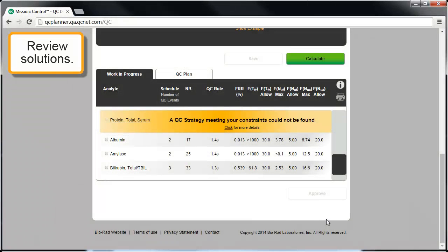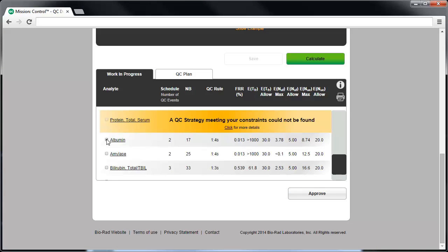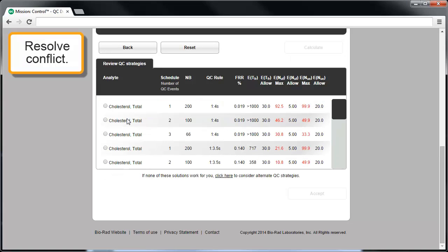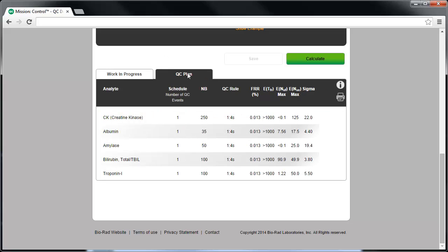If the displayed solution is acceptable, check the box and click Approve to add it to the QC Plan. If no QC strategy is found that satisfies all the specified performance requirements, a conflict exists between the specified performance requirements and the current QC strategies under consideration. These cases are highlighted in yellow — click on the analyte name to consider ways to resolve the conflict. The QC Plan tab displays your accepted solutions, which is your permanent record of the action steps taken to control the risk of reporting unacceptable patient results.